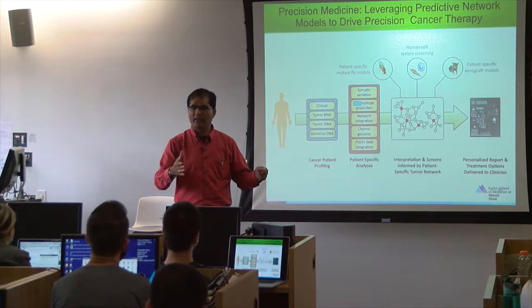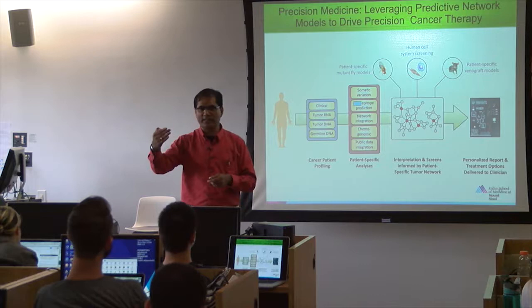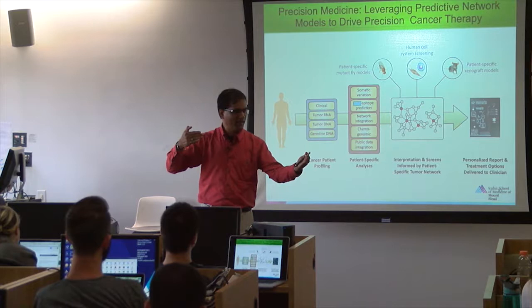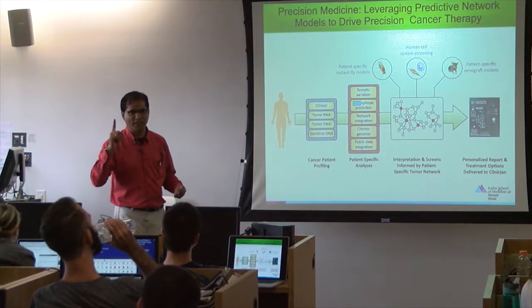So if you develop the markers, if you know which mutated DNA for that particular cell type is released in the blood, you can start sequencing at earlier intervals and then look for the emergence of that DNA. If you get it much earlier, clinically there is no symptom, but in the blood you are seeing that DNA coming. So immediately you can intervene there, right? Those kinds of things, precision diagnosis and personalized treatment, are possible because sequencing is faster, quicker and cheaper, because it is affordable also.